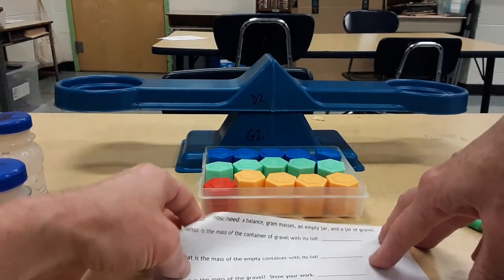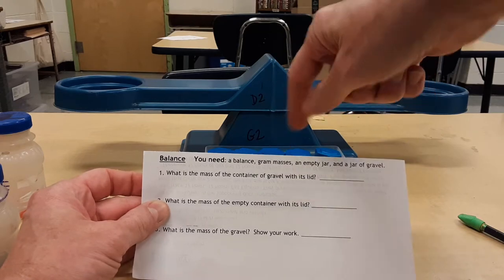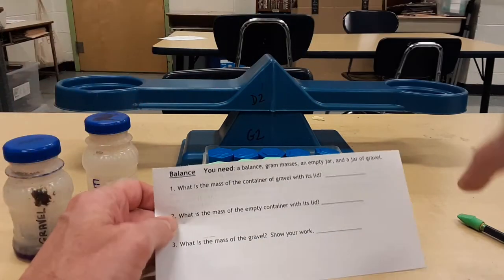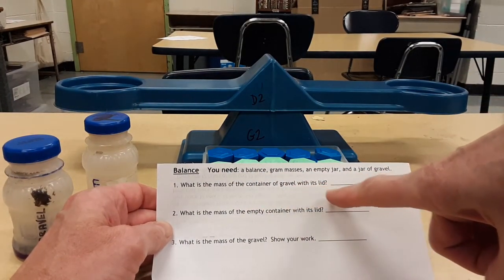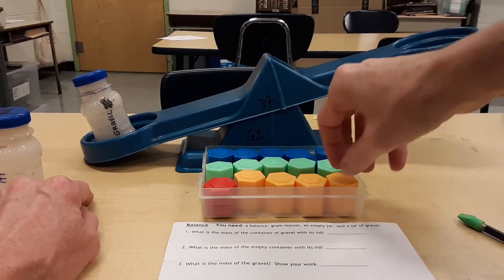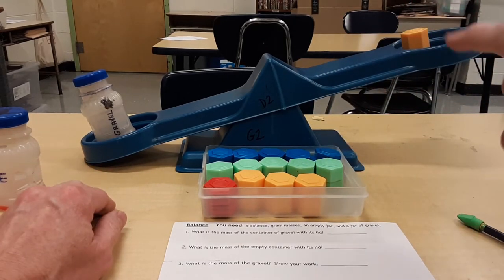So, looking at the directions, balance. You need a balance, gram masses, that's these, an empty jar, we have that, and a jar of gravel, we have that. Okay, step one, what is the mass of the container of gravel with its lid? Again, you say it that way because the gravel and the container and the lid all weigh something, so we're going to be finding the mass of all of them. Put it there. We're going to eventually want it in the middle, but it won't stay there yet, so don't worry about it. Put a yellow one, always start with yellow.